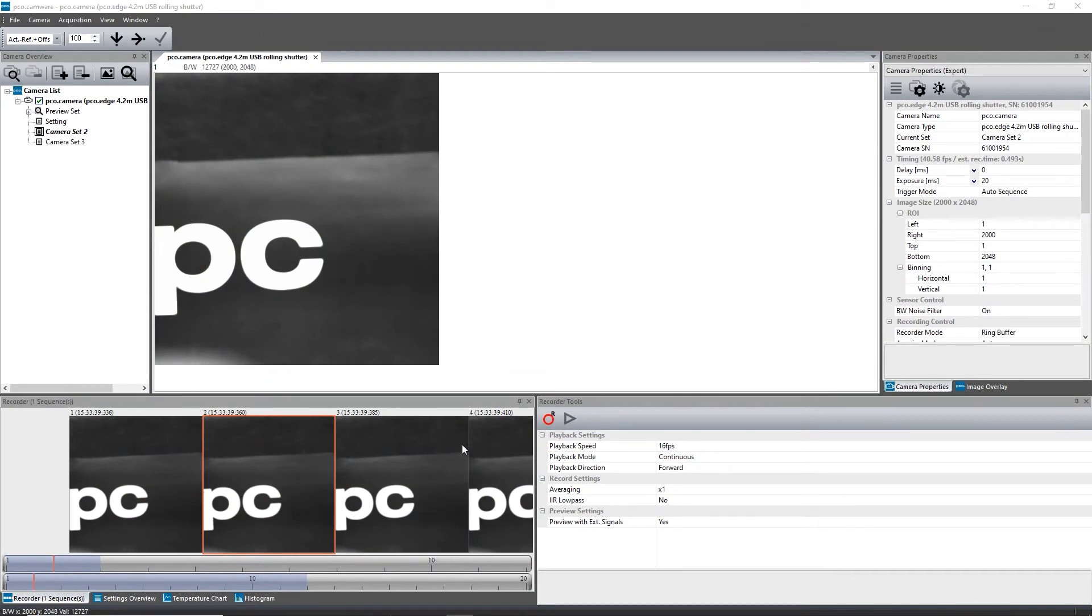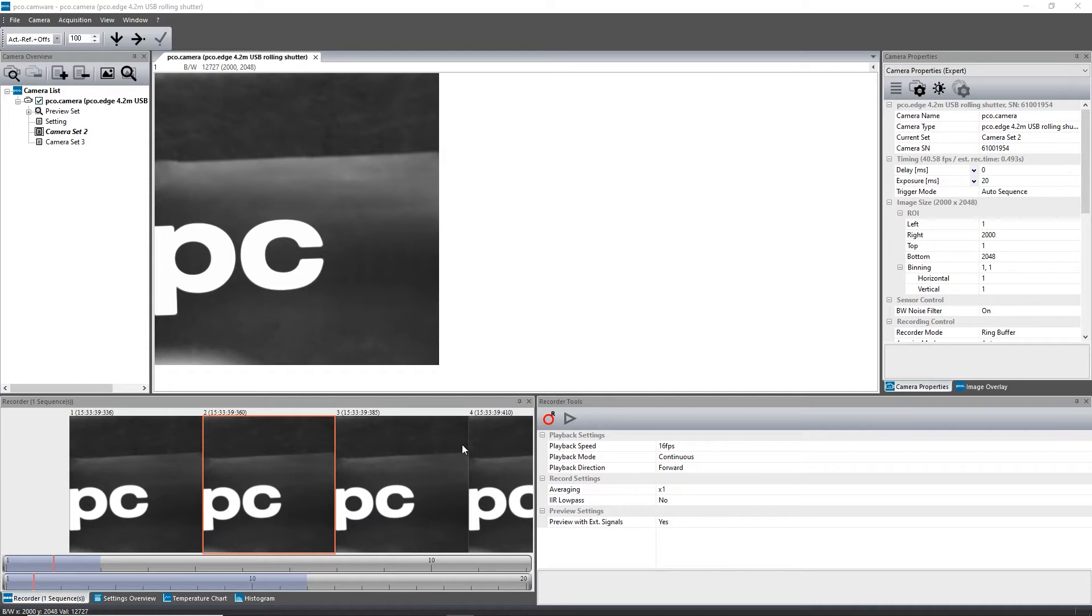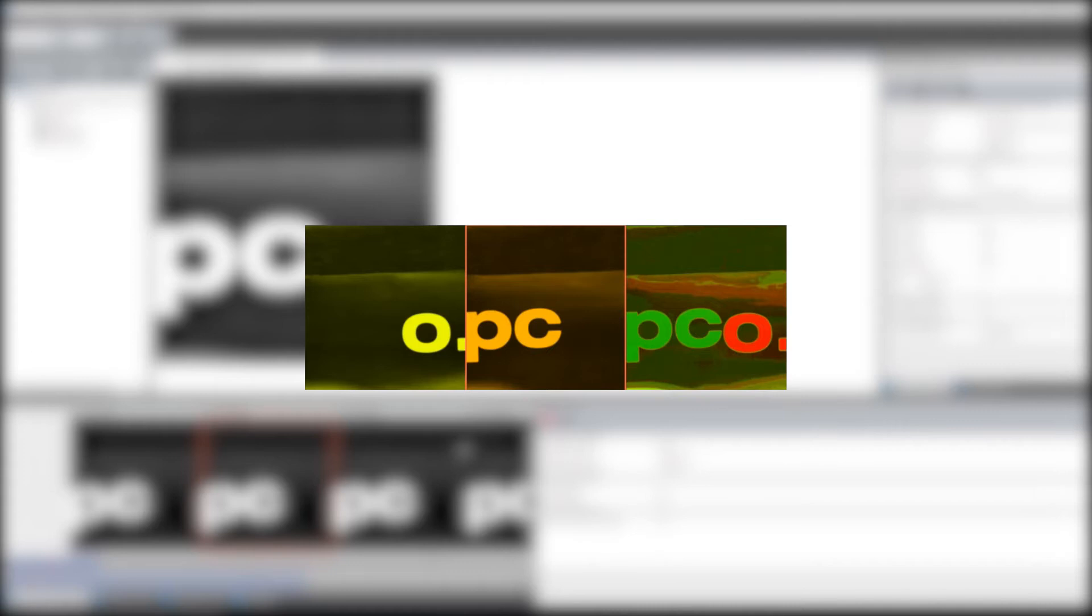For fluorescence microscopy applications, in addition to other specialized multi-channel setups, CAMWARE from Preseo offers the ability to overlay images taken under different illumination conditions and to separate these images by color. Be aware that this mode is only available with a monochrome camera.